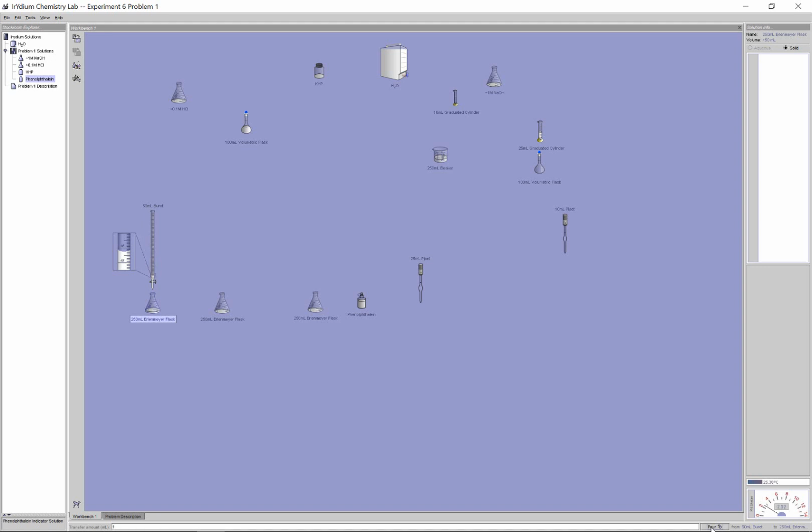You're going to find in a real titration, the pink color actually stays for longer and longer as we get closer to the endpoint, because it's getting harder and harder for the acid to actually find a base particle. That one I was actually cutting really close here. You'll notice I'm basically at the 50 mil mark. If I go any lower than the 50 mil mark, sure, there's still solution in the buret here, but I have no other way to measure it. So that actually worked out perfectly here.